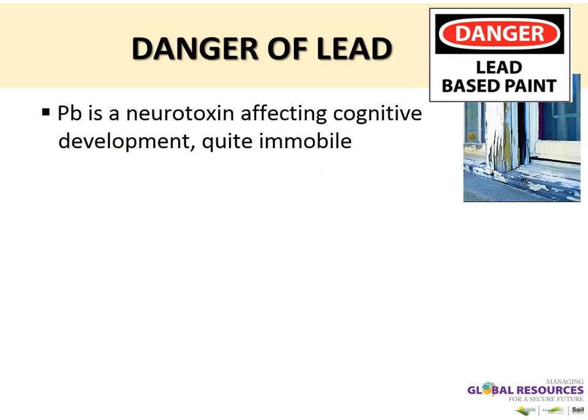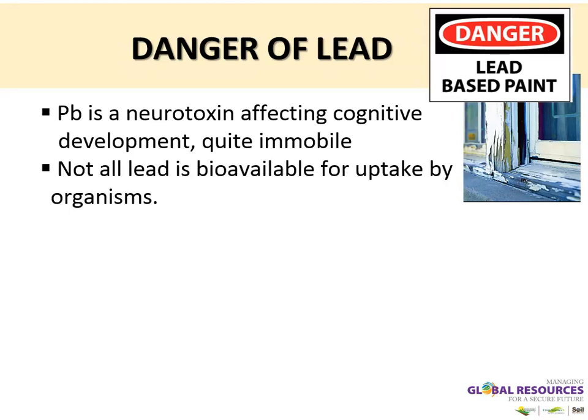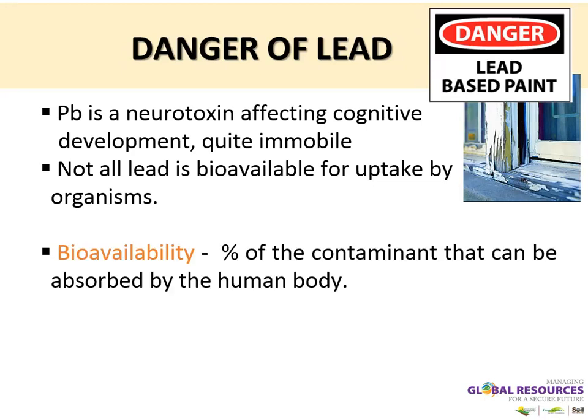Because lead is a neurotoxin and it's commonly present in urban soils. It has a negative effect on cognitive development of humans, especially children, because they're more sensitive than adults. And also soil lead is very immobile. It doesn't really move in soils a lot. Usually in the lab we test for total concentrations, but what is really more important is to test for bioavailable concentrations, or the fraction, the percentage of contaminants that can be available and taken up by the human body.